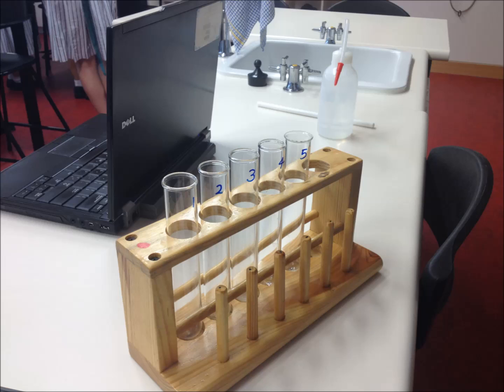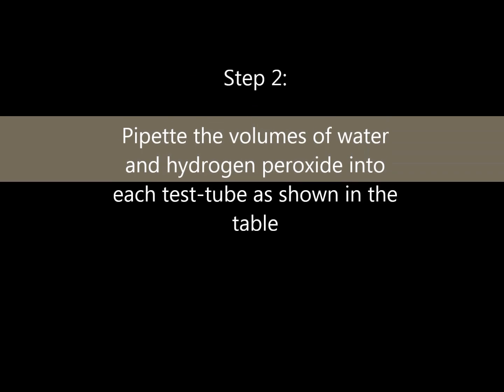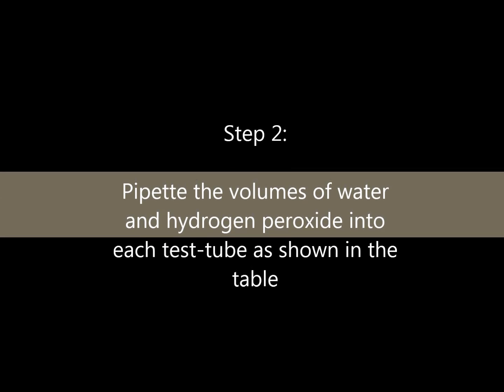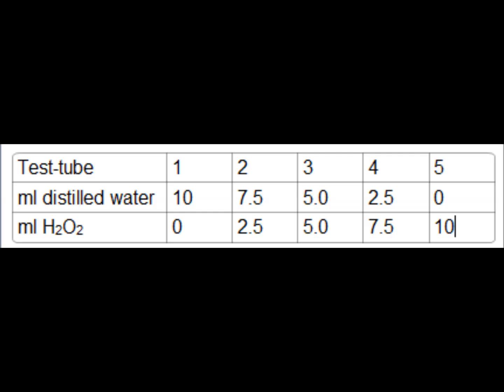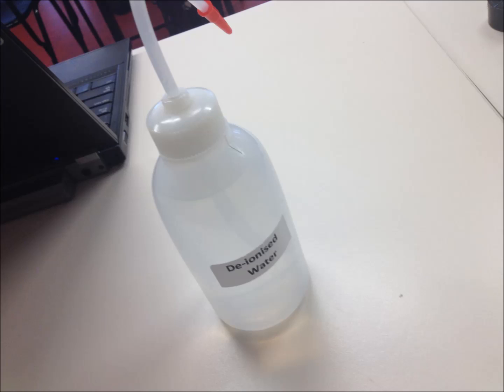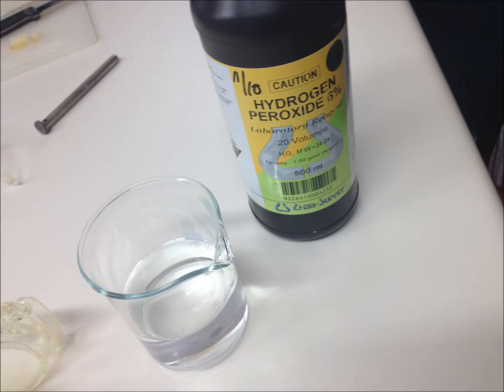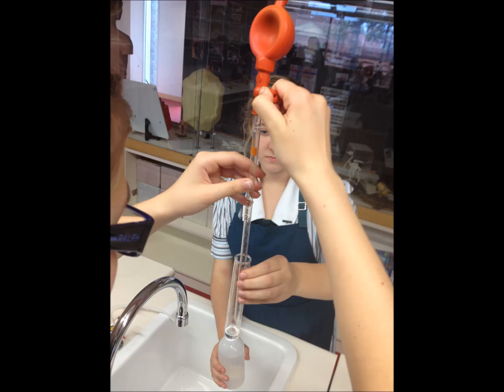Step 1: Set up five test tubes labeled 1 to 5. Step 2: Pipette the volumes of water and hydrogen peroxide into each test tube as shown in this table. Step 3: Mix the contents of each test tube.